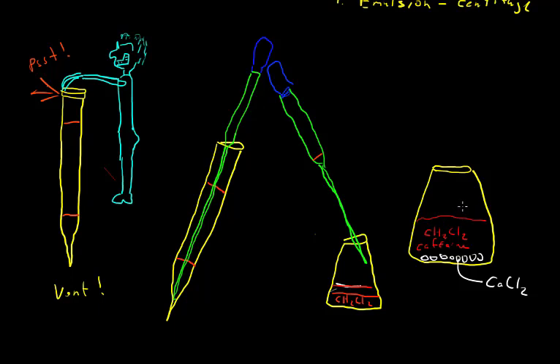Before you do that, it's a really good idea to weigh the flask. Actually, weigh your final flask that you're going to decant this into first, so you have the mass of the empty flask. Decant this into that flask after you weigh it. Then boil off the dichloromethane. The difference between the mass of the empty flask and the mass with the caffeine crystals in it, of course, is the mass of the caffeine. You'll need that for the yield of your extraction.